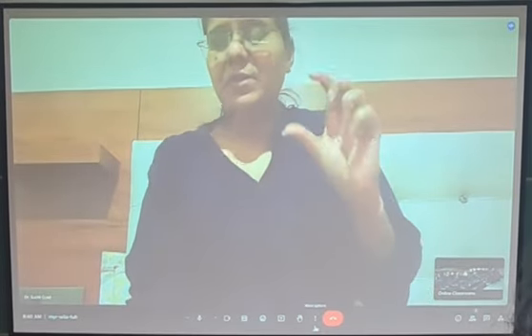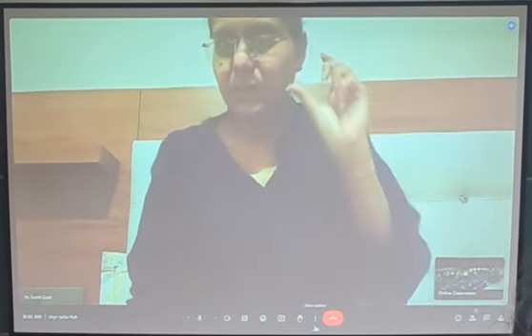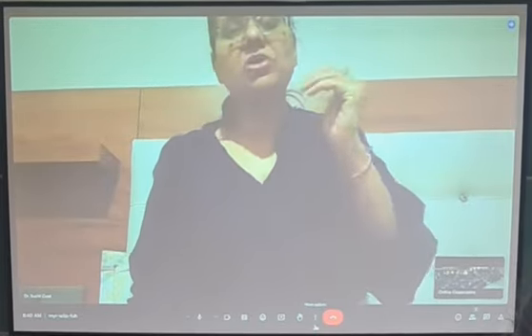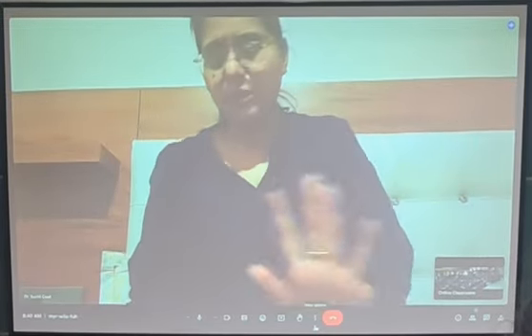Okay. So the MPN number is a very important number, and you should always check this number for drinking water. There is a range given by the government which you should be using to check whether this water is at a drinking level or it should not be taken by a human. Okay, so this is the standard MPN number used by all the regulatory agencies.